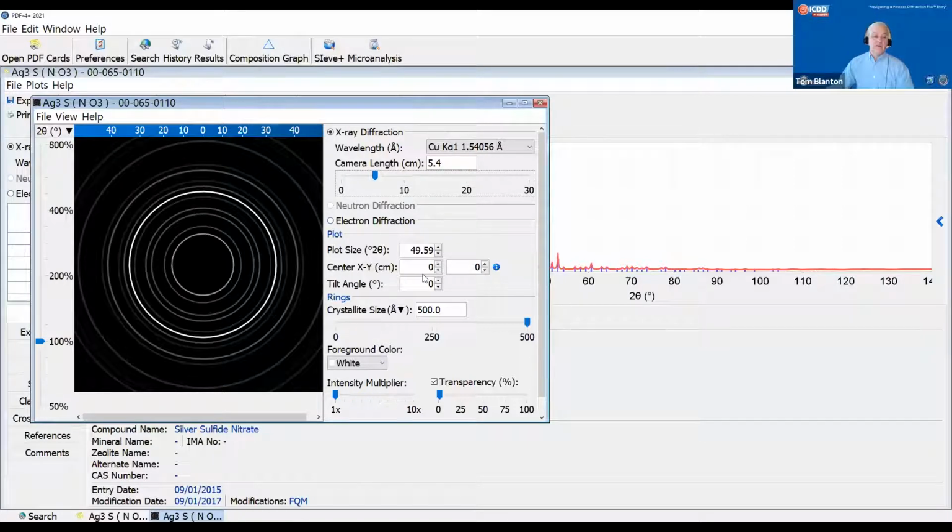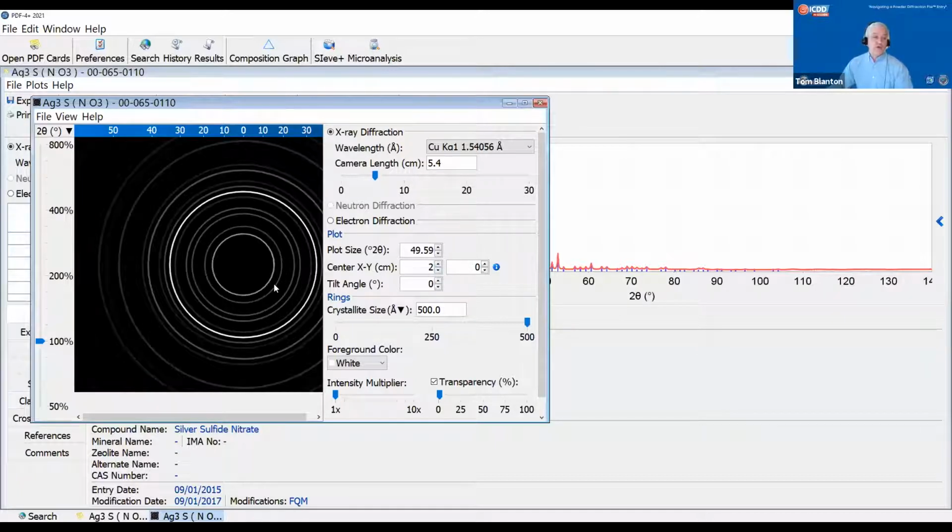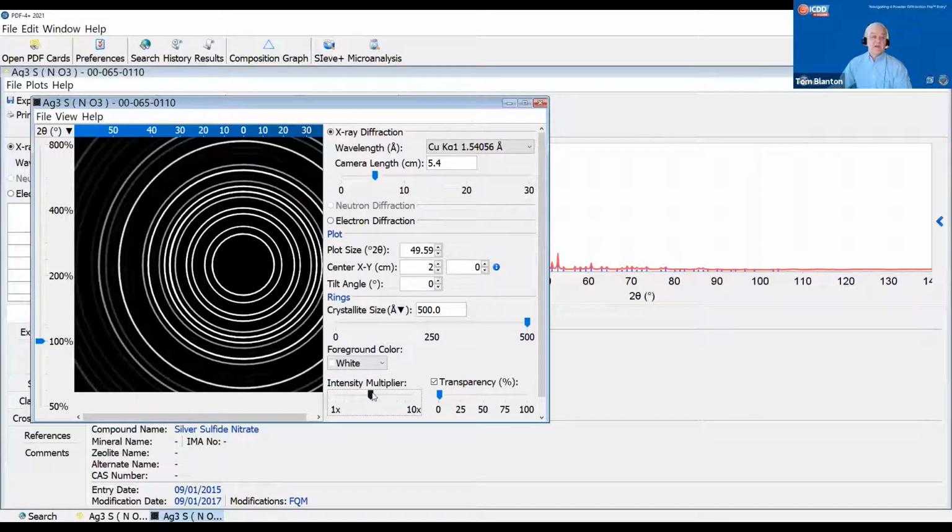You can rotate the camera so that you can change. Maybe you're not looking with a symmetrical detector position. Maybe you're looking at something where you have in fact moved the detector line. You can change your XY position there, so that you can simulate where my detector was located in a given sample. You can multiply intensities to make light lines or low intensity lines more intense.